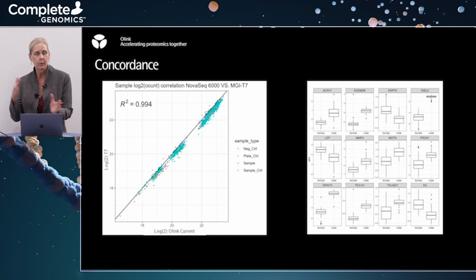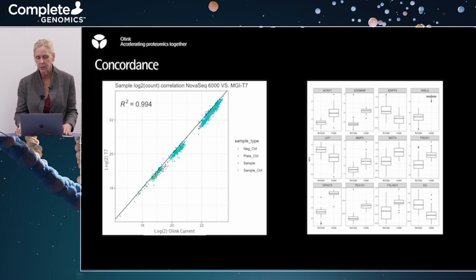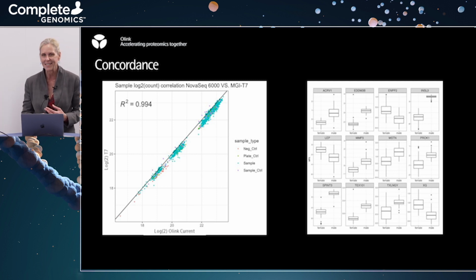And then informatically, we bring them back up to comparison levels to be able to then look often from cases to controls, identifying biomarkers. Now, I just wanted to include a little bit of biology about these. So we were able to stratify the males and the females in this and look at proteins that were expected to be different between genders. And we're definitely seeing the biology we expect. Not quite a one correlation, because that would be suspicious, but the correlation on the left is 0.994.